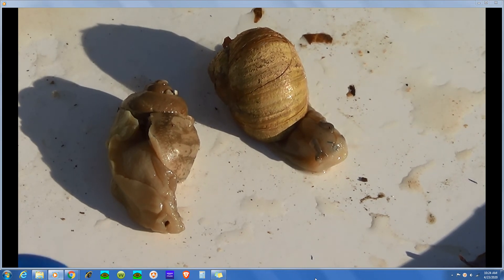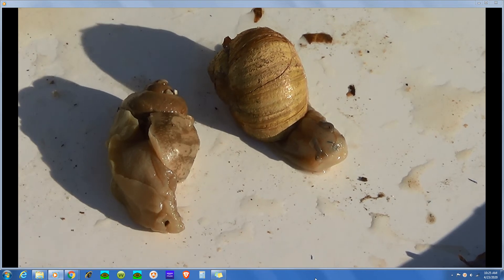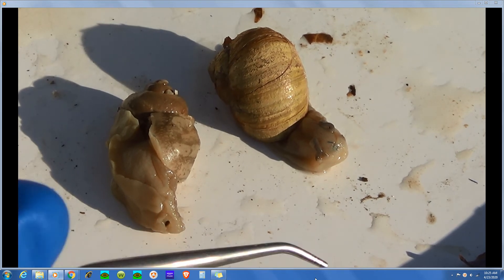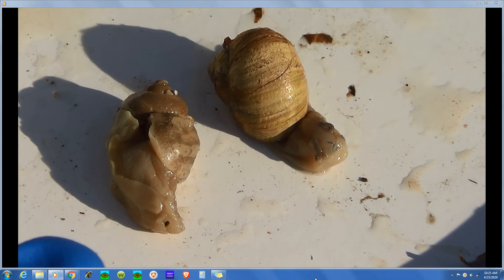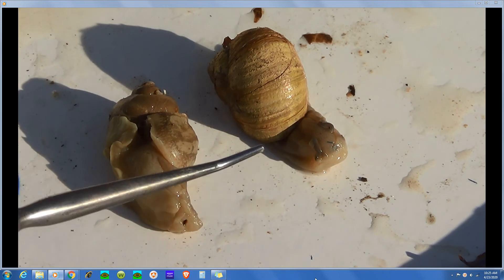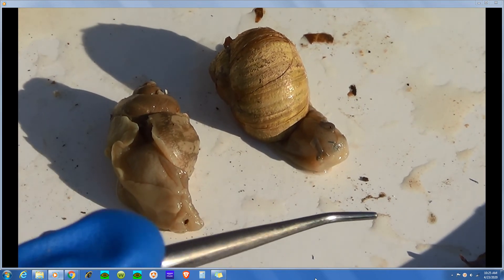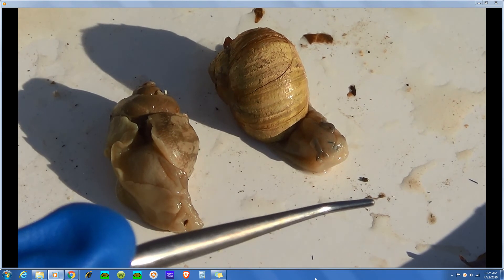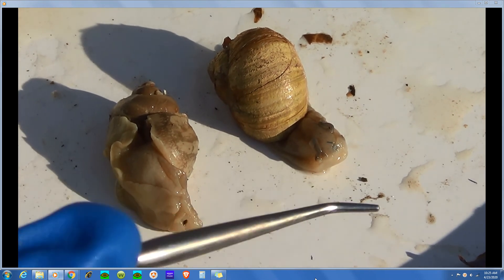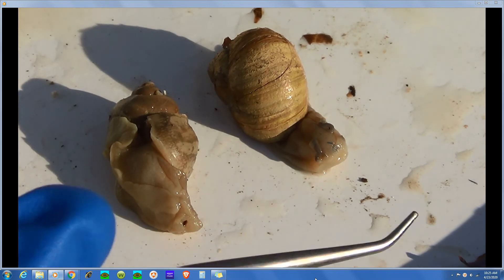These are mollusks, and the mollusk body plan is that they have a muscular foot or head foot — head suggesting cephalization, which is a concentration of sense organs in the anterior end of the body. Gastropods are very cephalized. They have eyes on stalks and two sets of tentacles. Those tentacles serve both a tactile sense of touch and chemoreception — sense of taste. The eyes provide photoreception, the sense of vision.